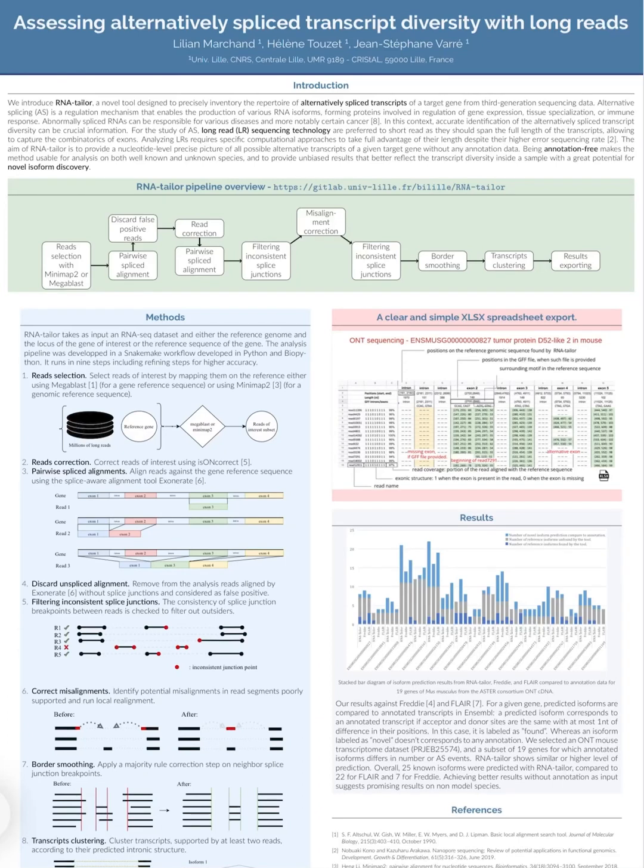Hello, I present you RNA Tailor, a new tool designed to precisely identify the alternatively spliced transcript diversity of a target gene from long-read RNA-seq data, such as PacBio or nanopore data. It analyzes the data without annotation, and it has the advantage of not being biased by previous knowledge and of being usable on non-model species.